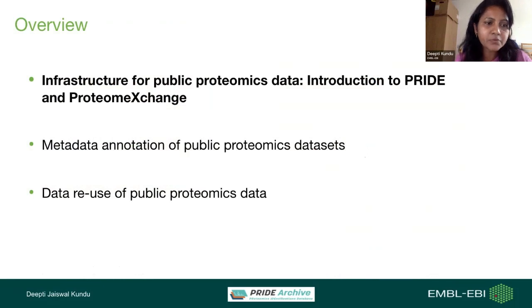So today I'll just give you a brief introduction of the PRIDE infrastructure and ProteomeXchange, the metadata annotation of the datasets, and then the data reuse of these public proteomic datasets. Next slide, please.